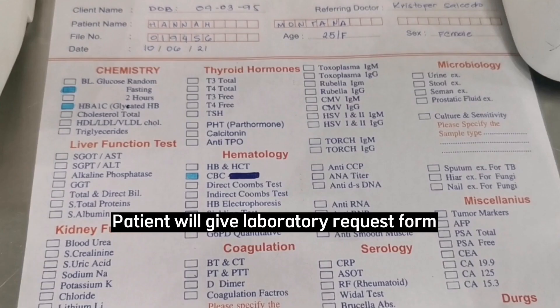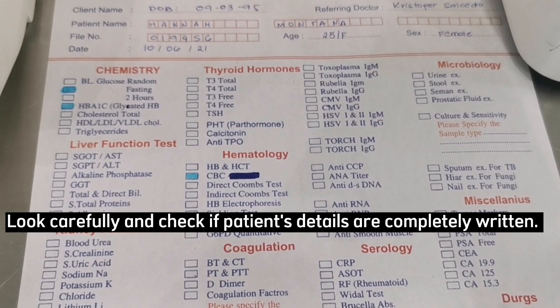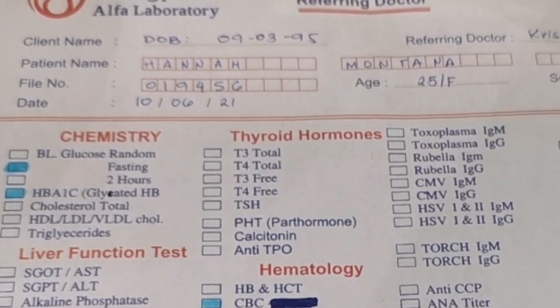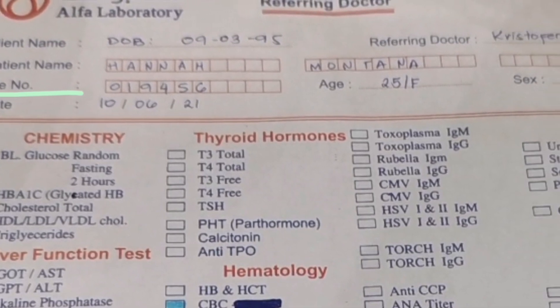When working in the laboratory, the patient will give a laboratory request form. Look carefully and check if the patient's details are completely written, such as name, date of birth, and patient's unique number.